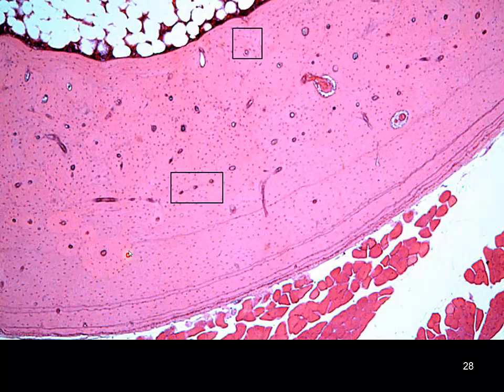Here we have a nice osteon, and you can see the Haversian canal cutting cross section, almost just the size of that red dot. When we see these in longitudinal section, then we've got a Volkmann's canal. Here you can see our inner circumferential lamellae, the plates. And then can you recognize this tissue here? A lot of that's going to be white fat, unilocular adipose tissue present in that marrow cavity.